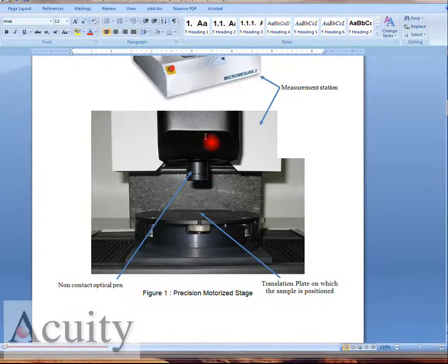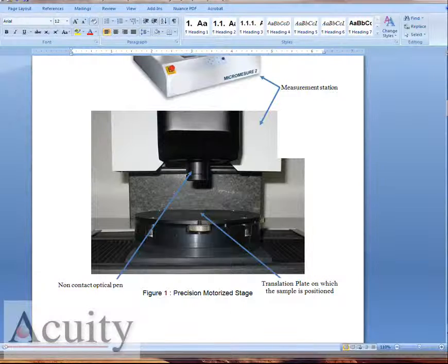The Z is manually adjustable and of course we have a little tilt table here so we can adjust it to well within a micron to make sure the target is very level.